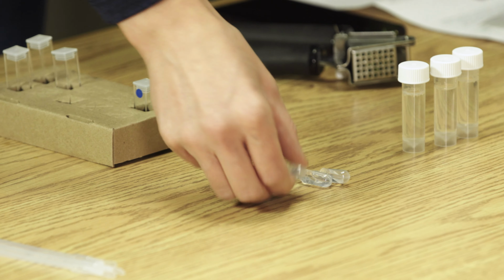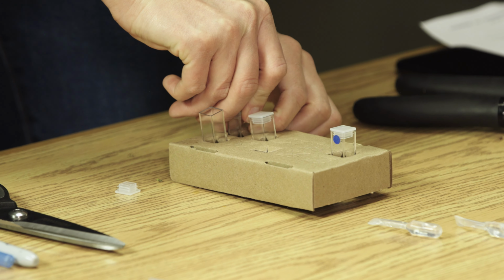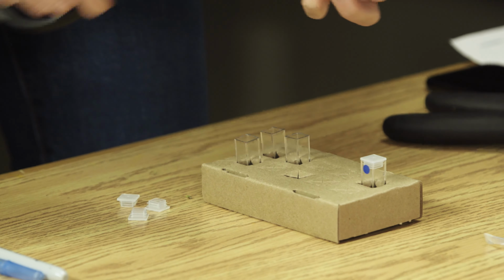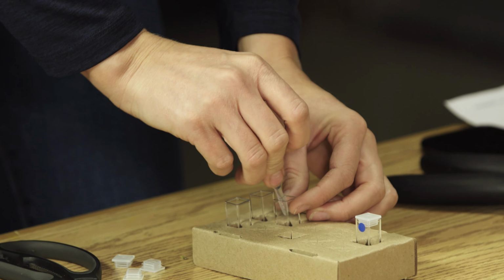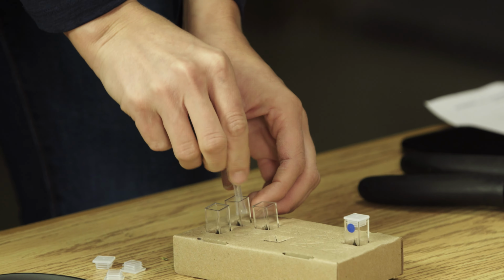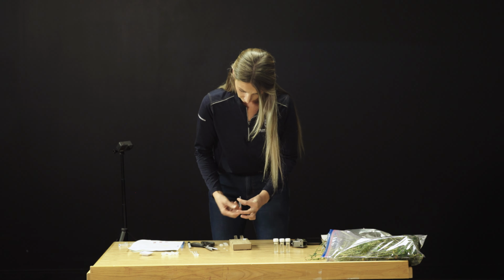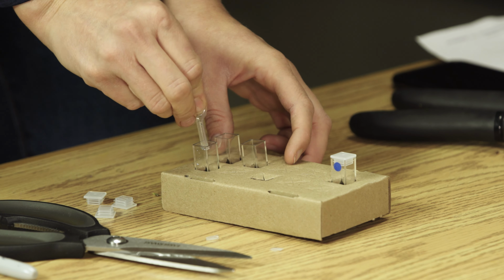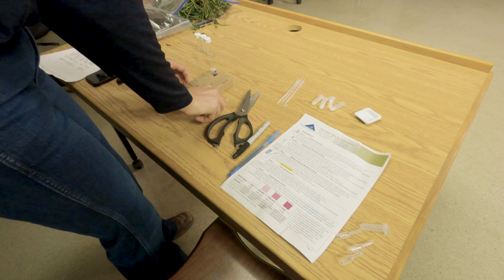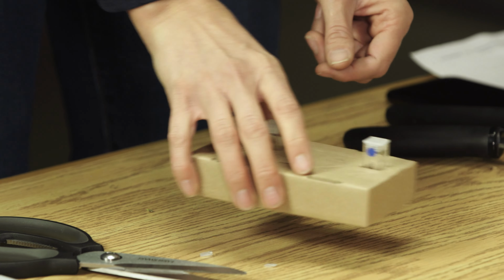Next, we're going to empty our squeeze bulbs into the remaining cuvettes. We will mix gently by swirling, not shaking.